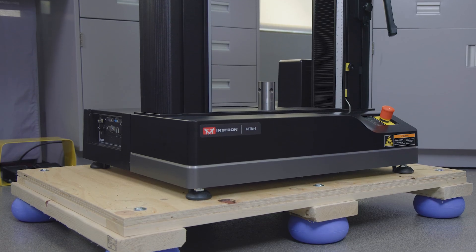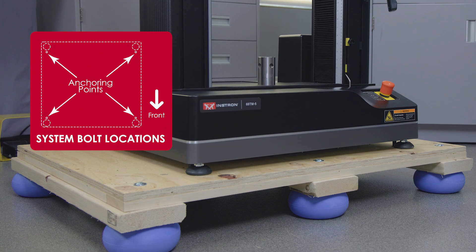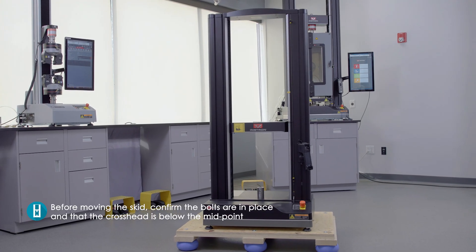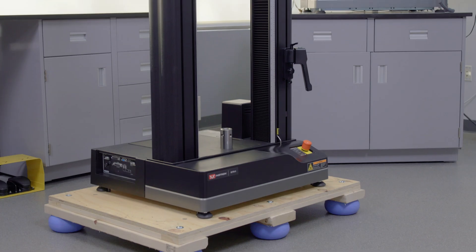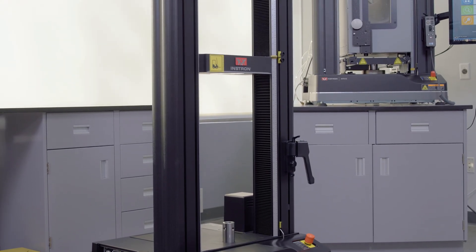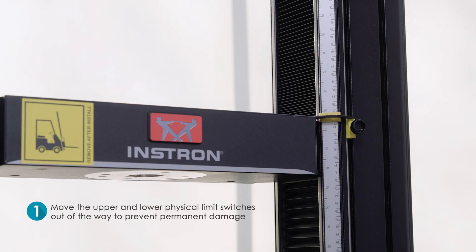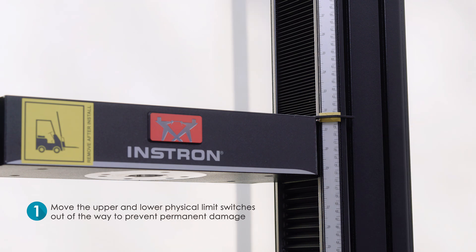If you have just received and uncrated your frame from Instron, it will arrive bolted to the skid. Before moving the skid, confirm the bolts are in place and that the crosshead is below the midpoint. Should you need to adjust the crosshead location without powering up the frame, you'll first need to move the upper and lower physical limit switches out of the way to prevent permanently damaging the safety equipment on your testing system.